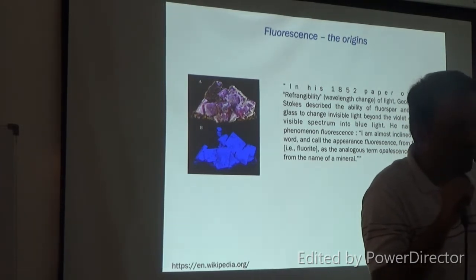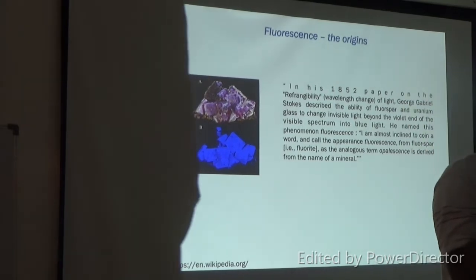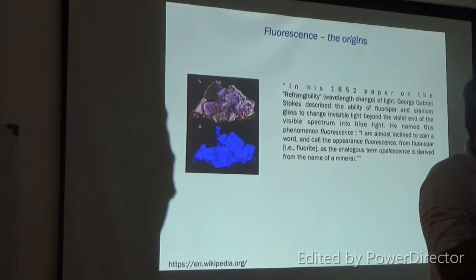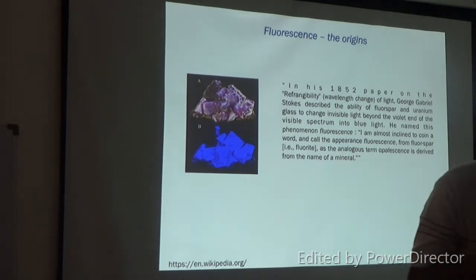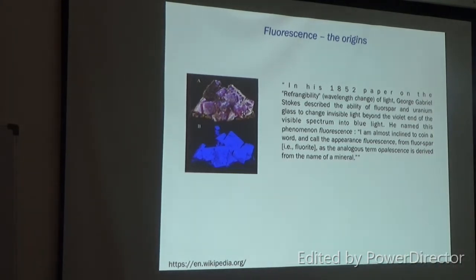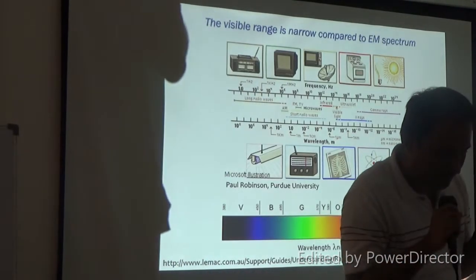You excite with UV, you emit in blue. You excite with blue, you emit in green. You excite with green, you emit in orange, and so on and so forth. And then you can use that.